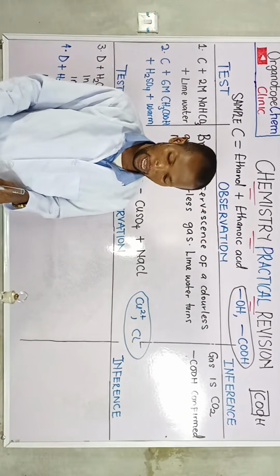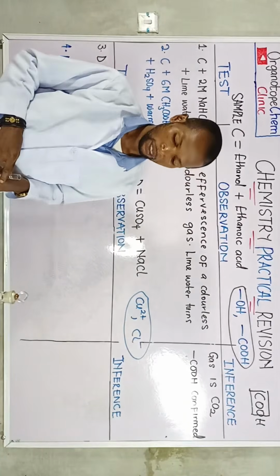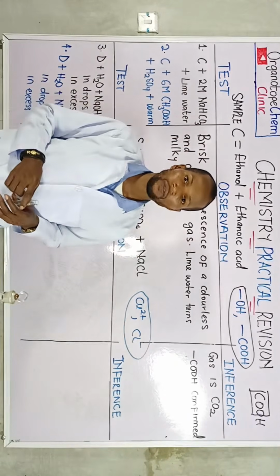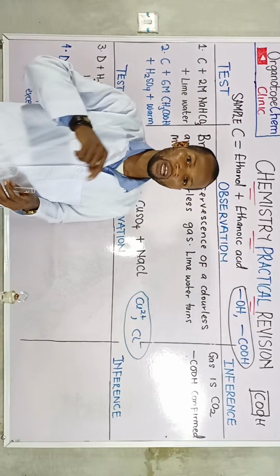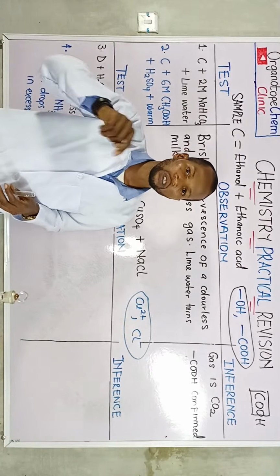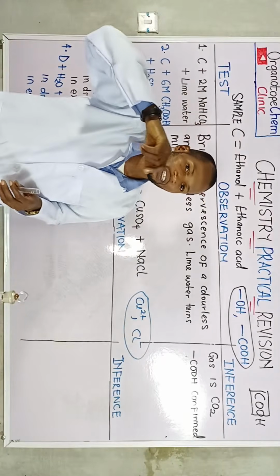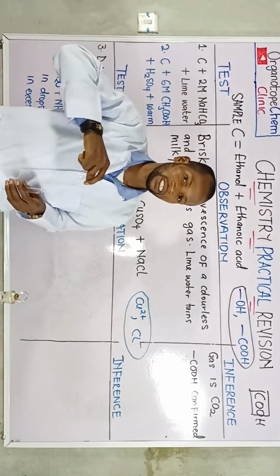Then add a few drops of H2SO4, tetraoxosulfate(VI) acid. That is the right acid for this qualitative analysis.